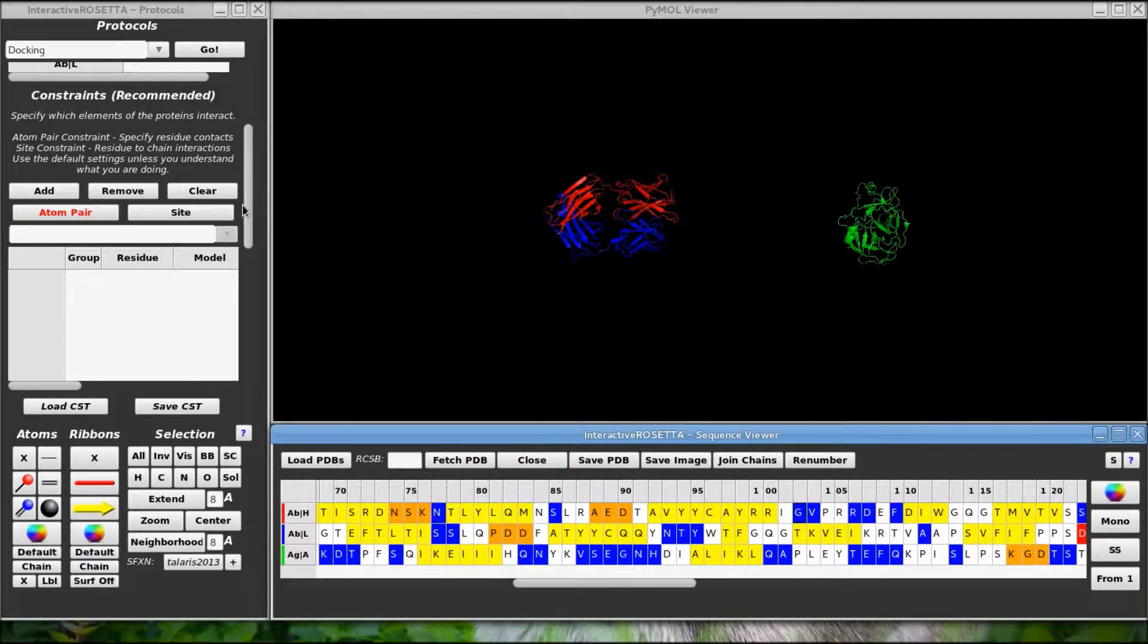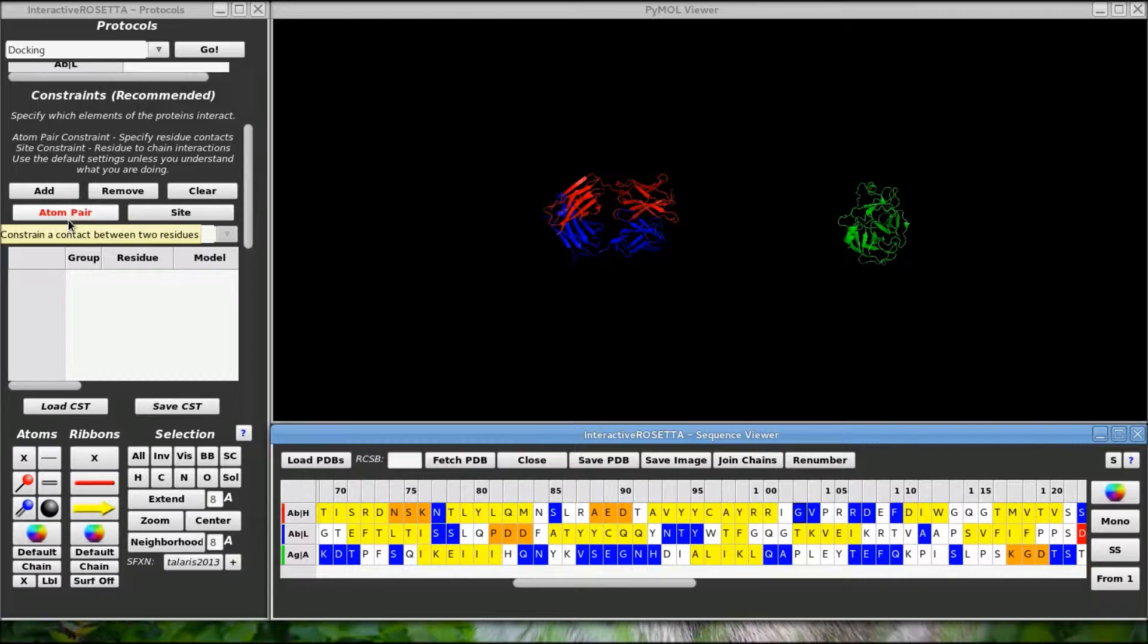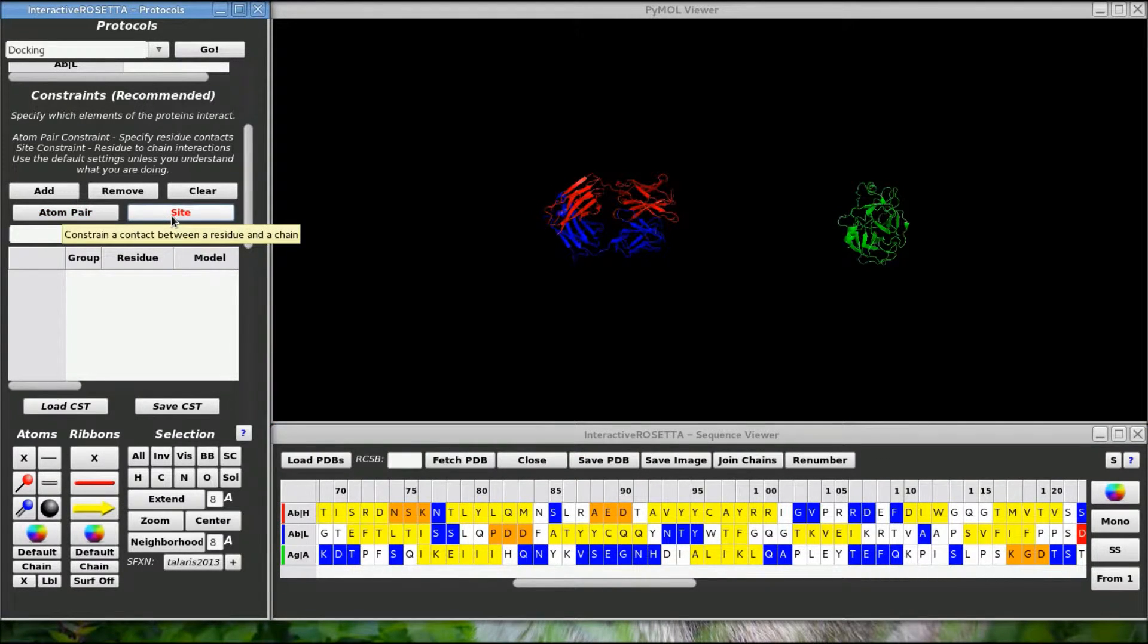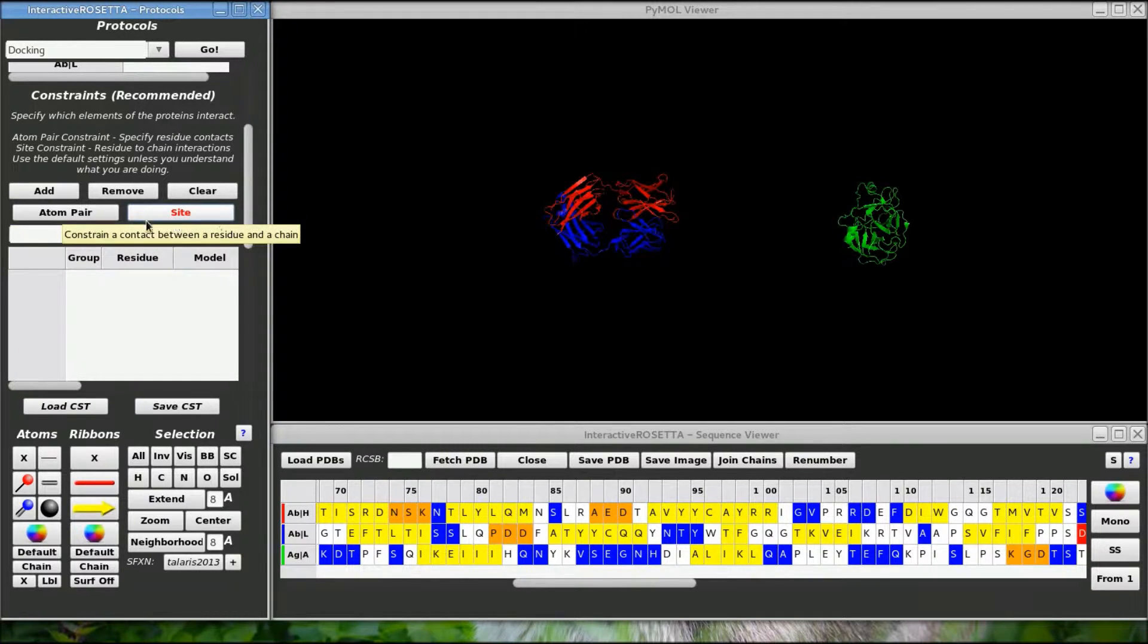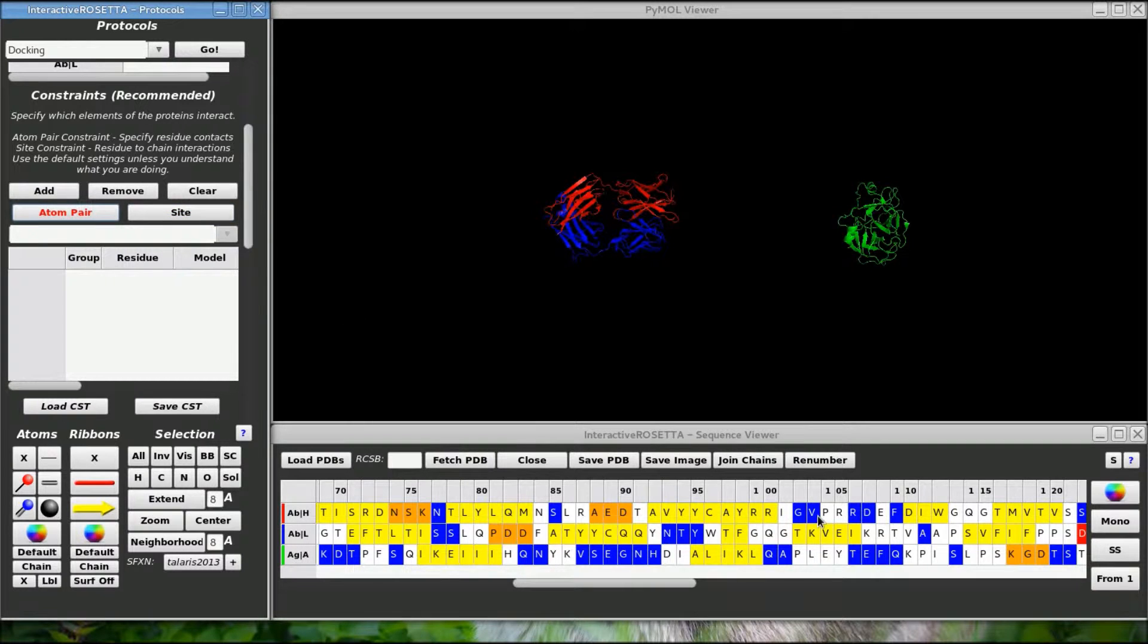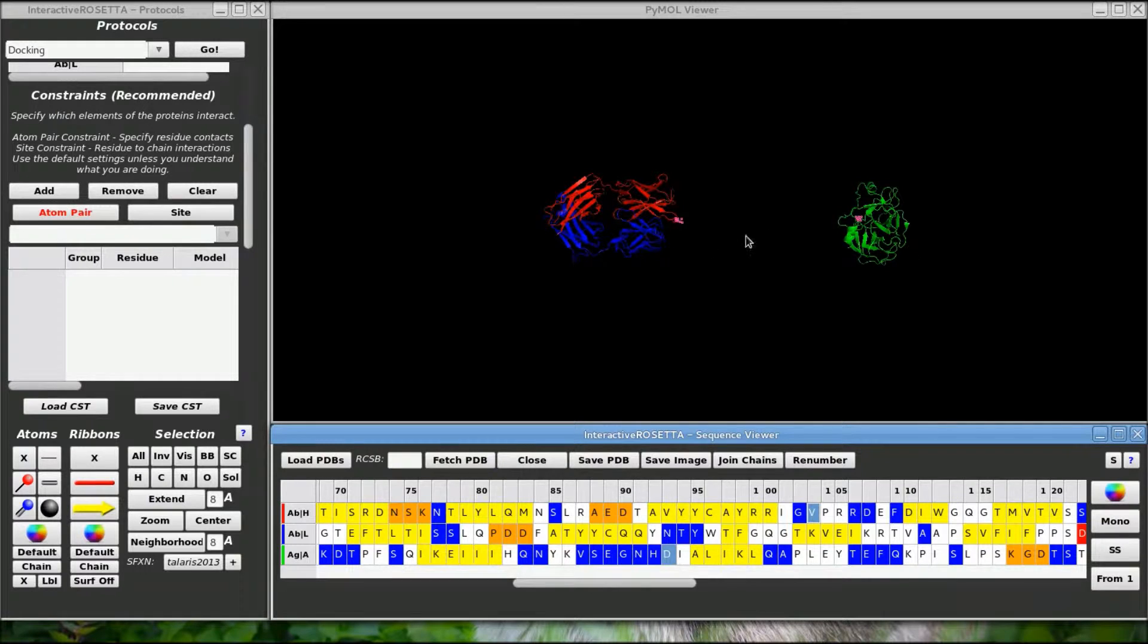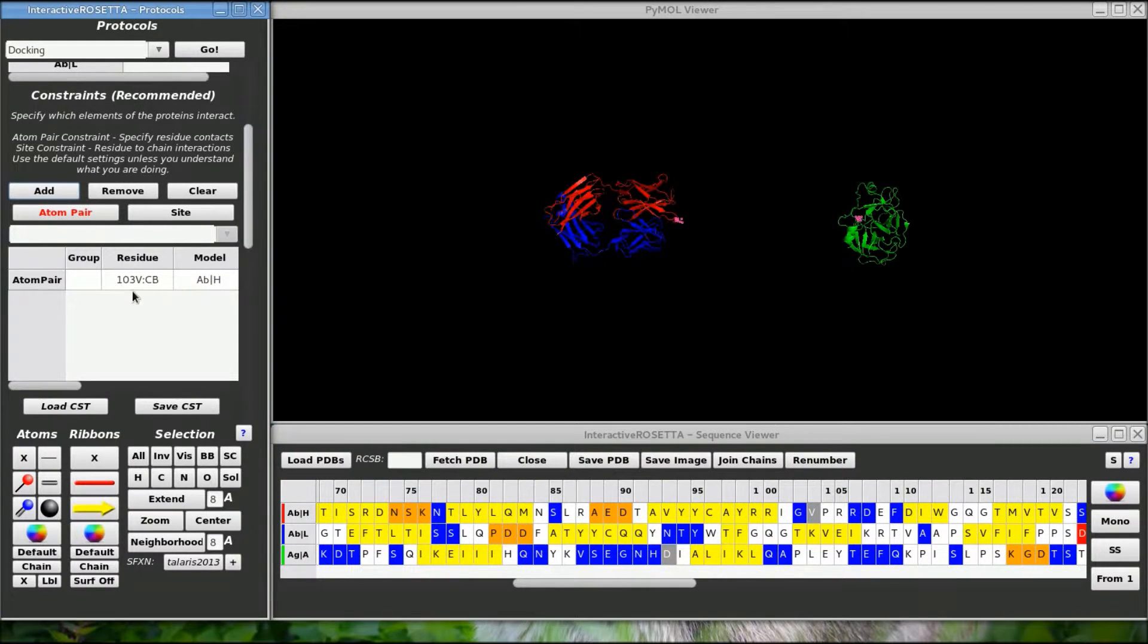There are two types of constraints: atom pair and site constraints. Atom pair constraints force two atoms to be within a certain distance. Site constraints tell Rosetta to keep an atom within a certain distance of any atom on another chain, so they are a bit more ambiguous. So let's say I happen to know that these two residues are in contact with each other in the docked structure.